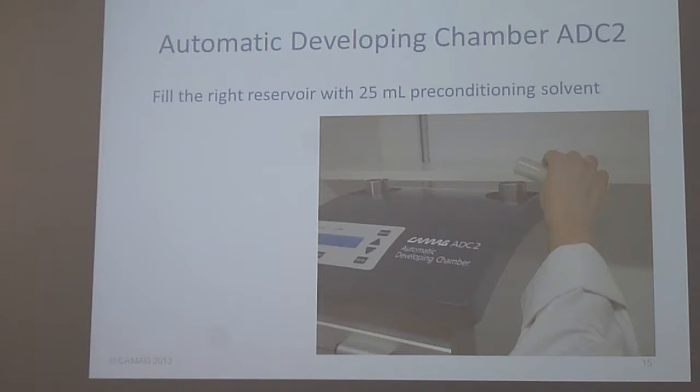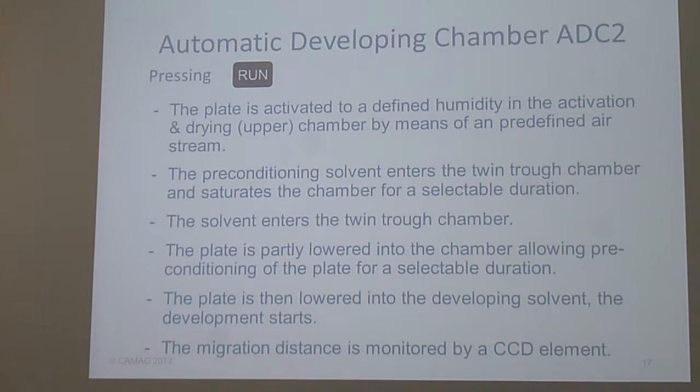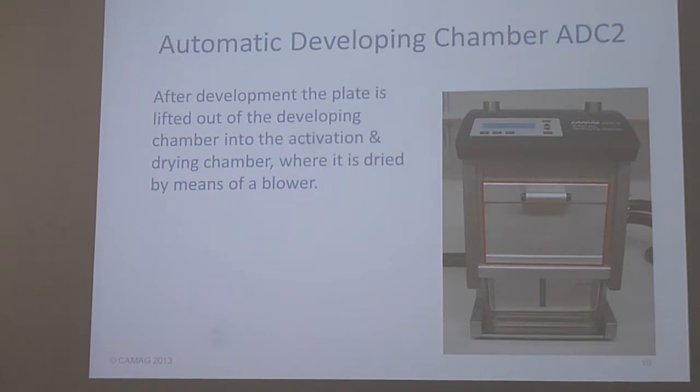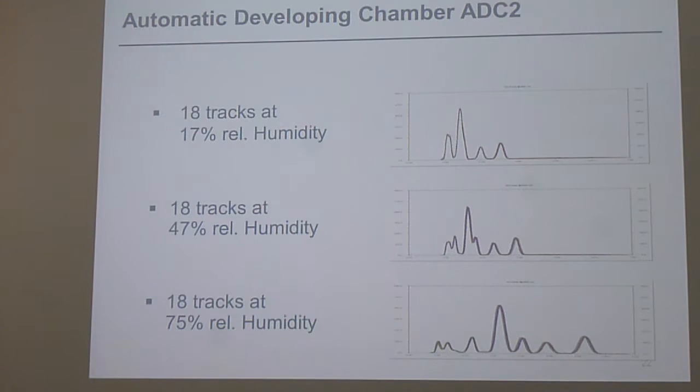It's more explaining how to use it. You can press run, then you do the last developments the instrument did, things like that. So this is more giving you an introduction into the instrument. Also here the humidity control, again to show that on the bottom there has to be some salt. Or if there is no salt, for sure it is going to the wrong humidity, because then the salt is not saturated.